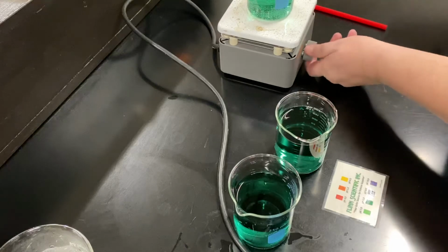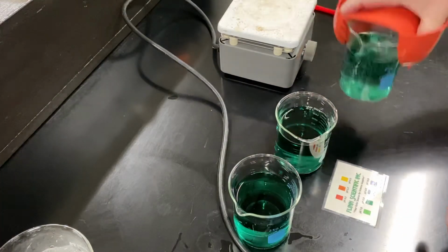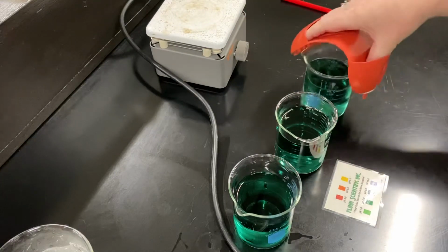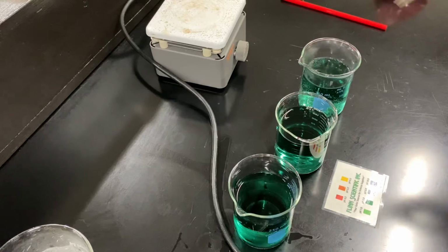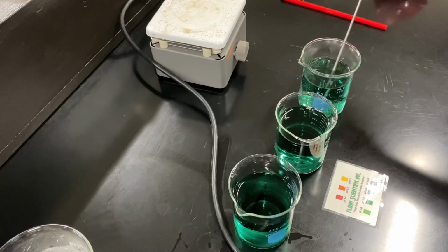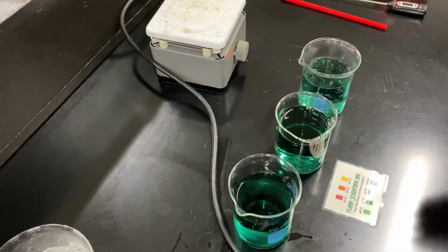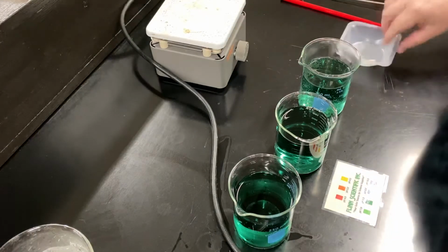Our hot water treatment, the hot water treatment is at 70, still going up, 78.7. So now what we're going to do is we're going to put 1 gram of Alka-Seltzer in each one of these. I will try and do these as simultaneously as possible.